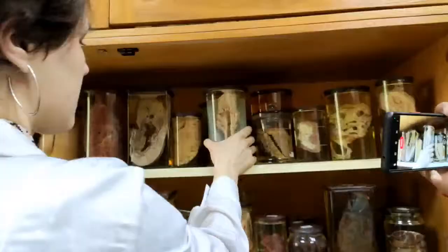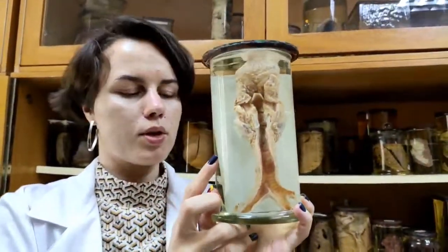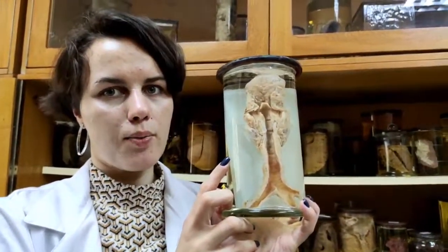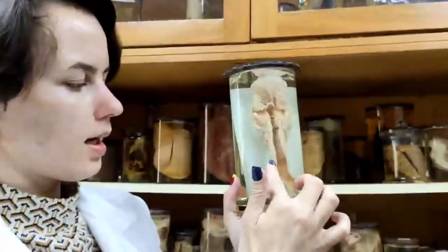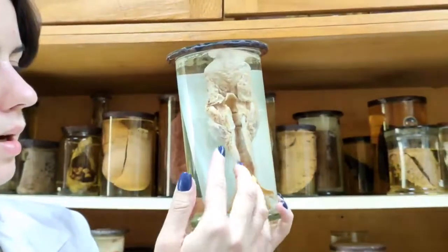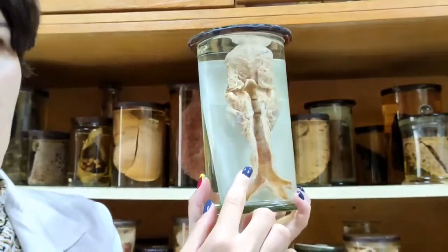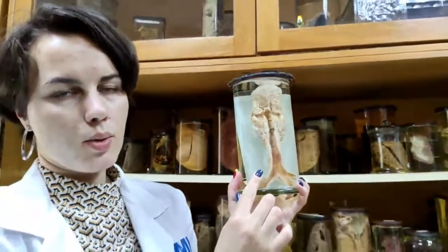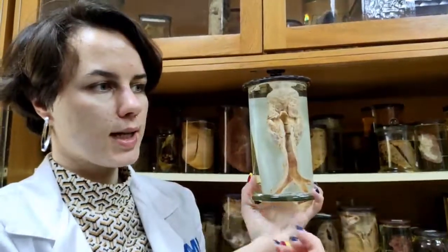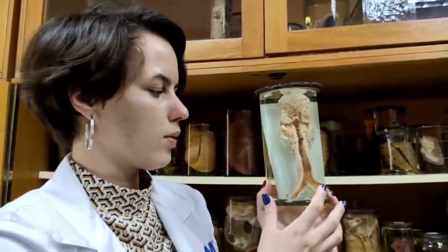Scleroma. Scleroma is a productive inflammation which involves the upper respiratory tract. And here you can see the larynx, trachea, and main bronchi. The mucosa of the trachea is infiltrated. Scleroma is caused by Klebsiella rhinoscleromatis. When you are talking about infectious or parasitic conditions, you should always name the etiological organism.